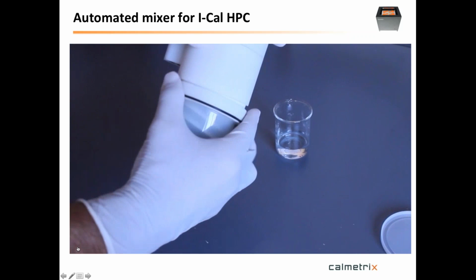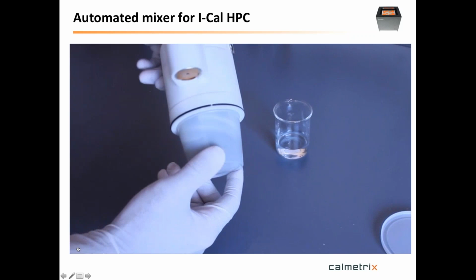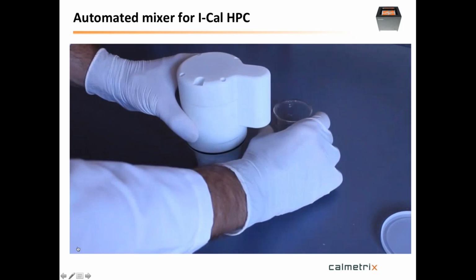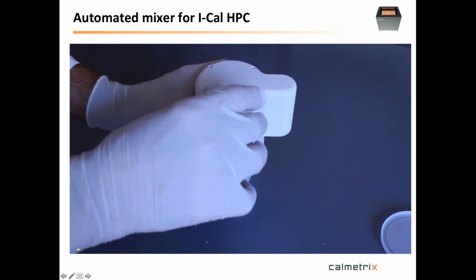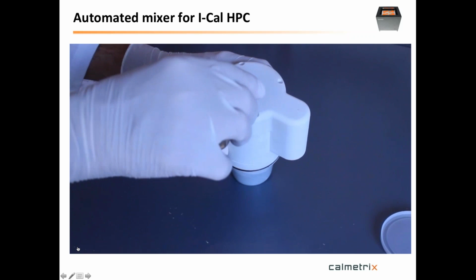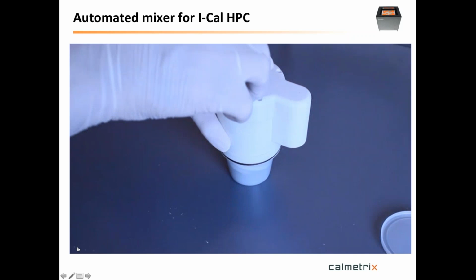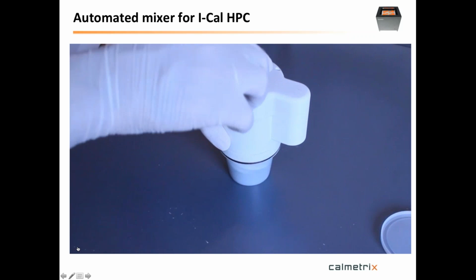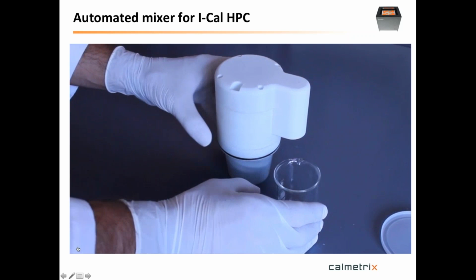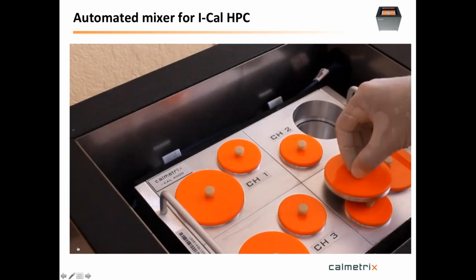It takes not long, like a minute, to do all this. And then once you have your cement on the bottom, you have a water compartment on the top where you can add the water quite easily. In this case, it was 50 grams of cement and 25 milliliters of water. So all very standard. And when you're done with that, then you can just take that mixer and insert it into one of the calorimeter cells.